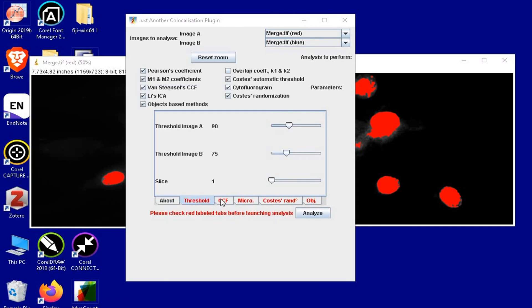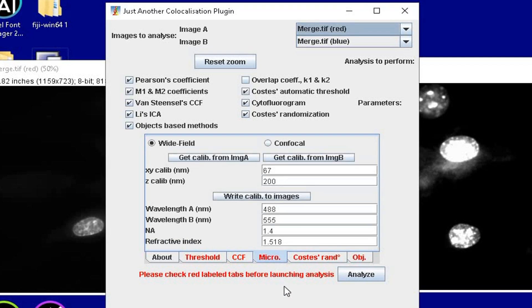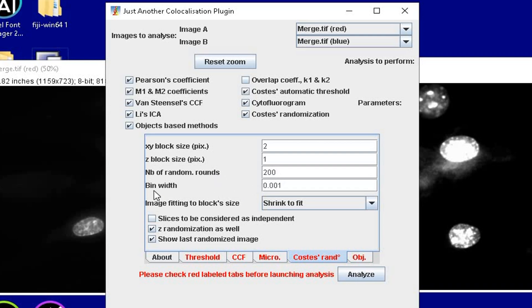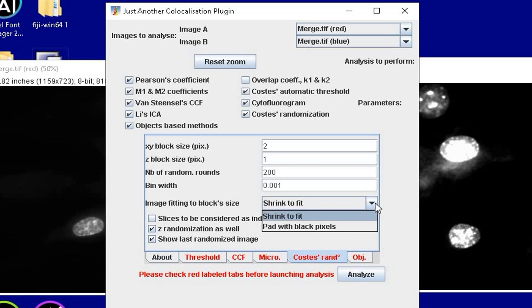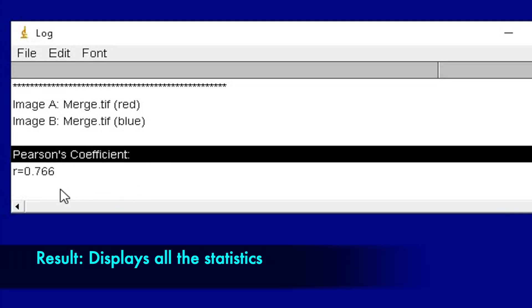Next, under CCF, make sure the X shift is 20. Under microscope, make sure that the metadata are correct. Under Costes' randomization, the number of random rounds should be minimum of 200 and bin width as 0.001. The image fitting to blocks size should be set to shrink to fit and then click Analyze. The result window will display all the statistics including the Pearson's coefficient.